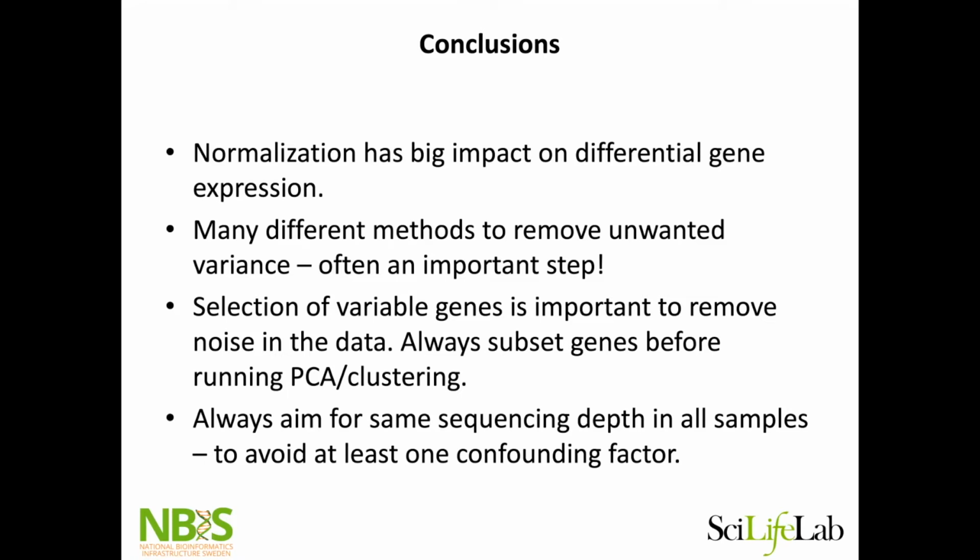And always I do some sort of selection of variable genes. It might require quite a lot of genes if it's a super noisy data set.